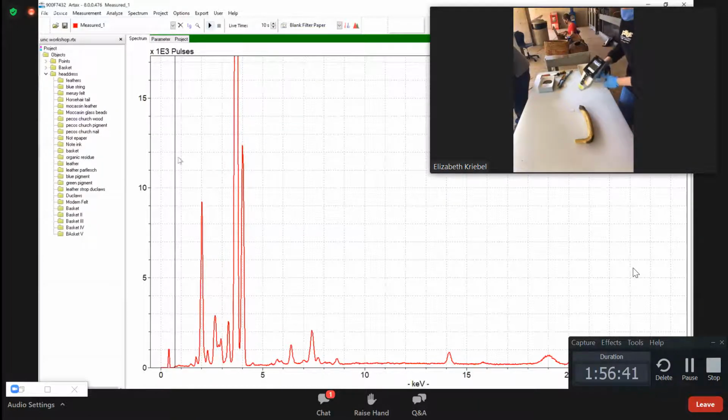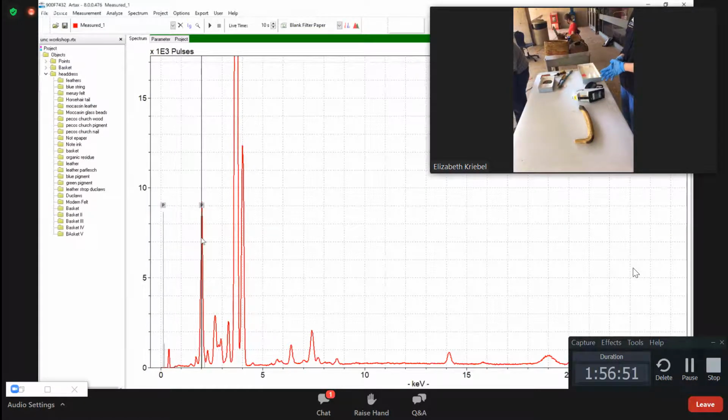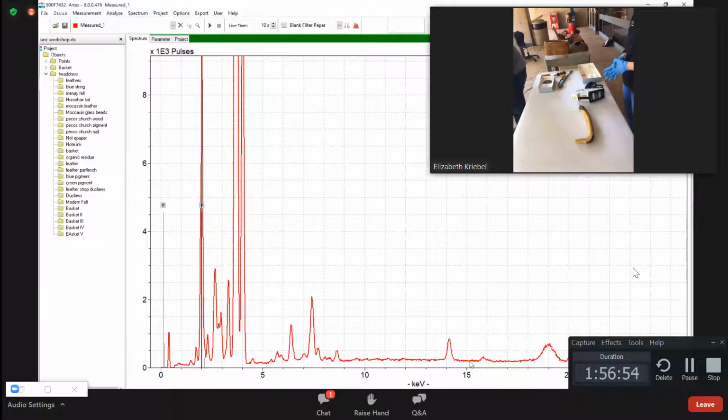Okay, hold on. Yep, so this is bone, calcium. You can always tell bone because, obviously the calcium's a giveaway, but the phosphorus is always going to be sky high. You'll also see, especially with older bones, there'll be some silicates mixed in the cracks, and a high amount of strontium. There is some discussion in the literature that you can use the strontium in bones as a rough estimate of the plant versus meat portion of the diet. Just because if you're eating plants, you're getting a lot more nutrients and there's a lot more strontium in it. The data is not super great on it, but relative to, if you're working within a single food chain system, it's really good to discriminate, but if you're comparing across different ecosystems, there's no actual hard number to use, so it loses its utility.